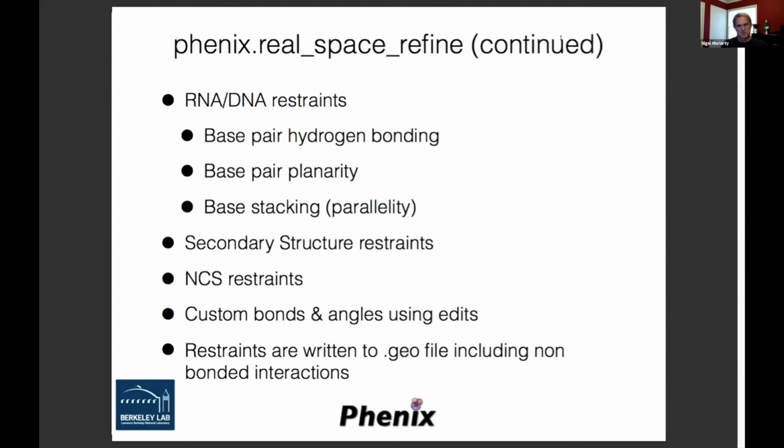Now, it is quite large, like I said, but it's also ordered in groups by type of restraint. So bonds are first, and then edited bonds come after that, in some groupings. It also shows you the worst offenders for variance from the mean. So the first bond that you will see is the one that is the most stressed, or has the biggest sigma outlier. So that is definitely a place to look if you're having issues.